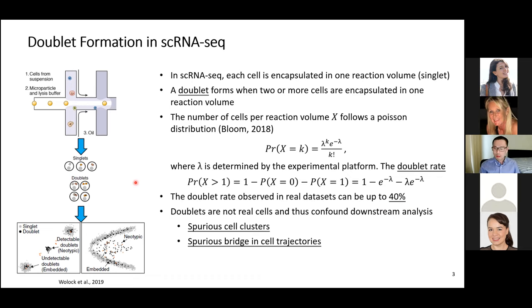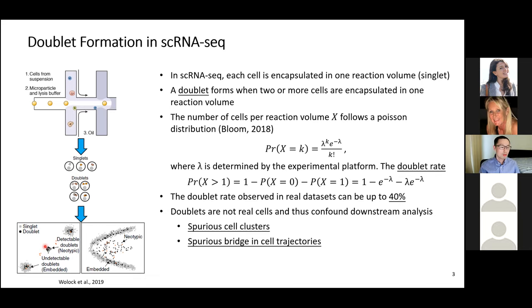High doublet rates can confound or bias your downstream analysis because they introduce artificial gene expression in your cells. For example, this figure illustrates the bias in downstream cell clustering analysis. Say the biological sample actually has two clusters, but due to the existence of doublets you observe a third cluster containing all the doublets — because doublets contain a combination of gene expression from two cells, giving them unique gene expression. You would falsely believe the sample includes three classes rather than two.